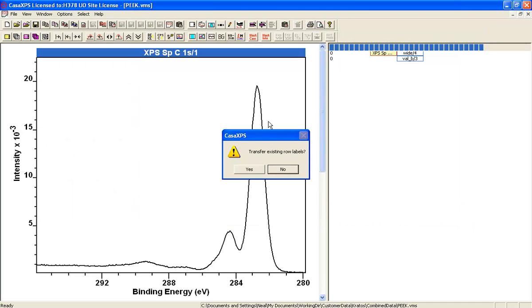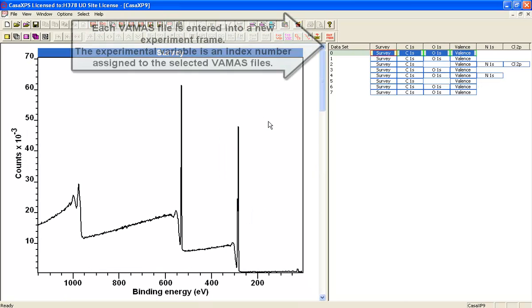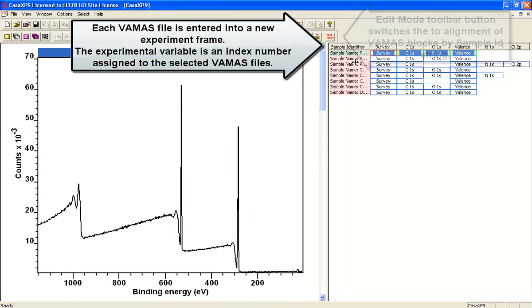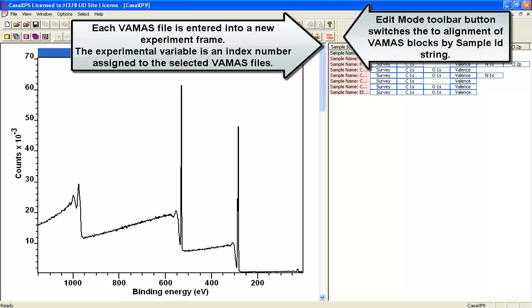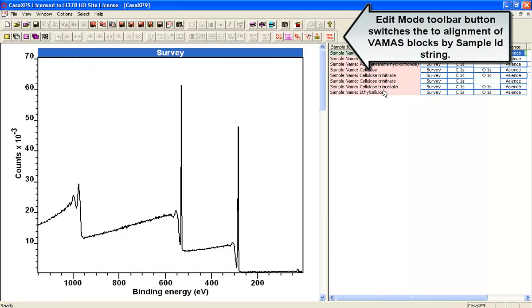When I select the VAMAS files, these VAMAS files are all collected together in a file which I can identify using the strings that were within these VAMAS files.